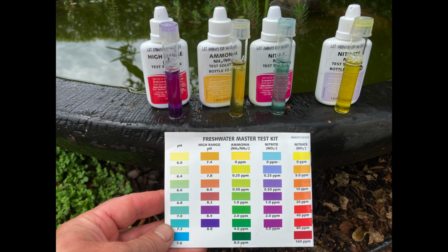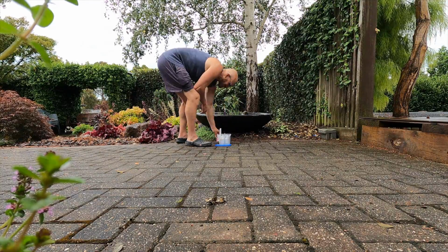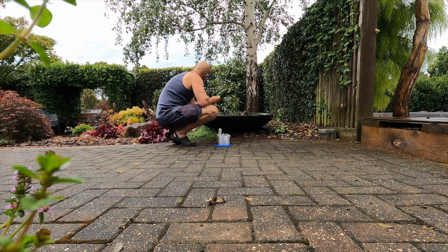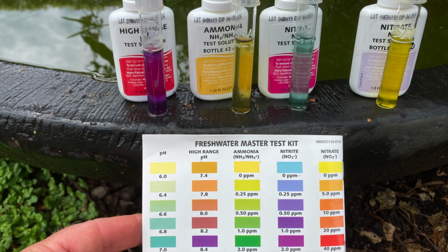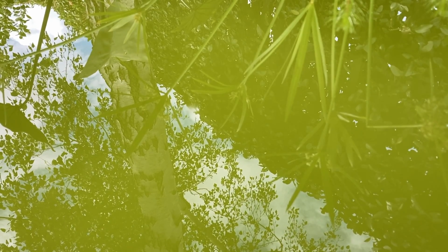While I was there, I also tested the ammonia, nitrite and nitrate, and just as I expected, they were all negligible. Again, I figured this is because the single-celled algae that has turned the water green has become the filter, and it's doing a great job at consuming all that nitrogen. Anyway, as we can see from the Kactoily and the API test kit, the water apart from the pH is pretty comparable to the other ponds.